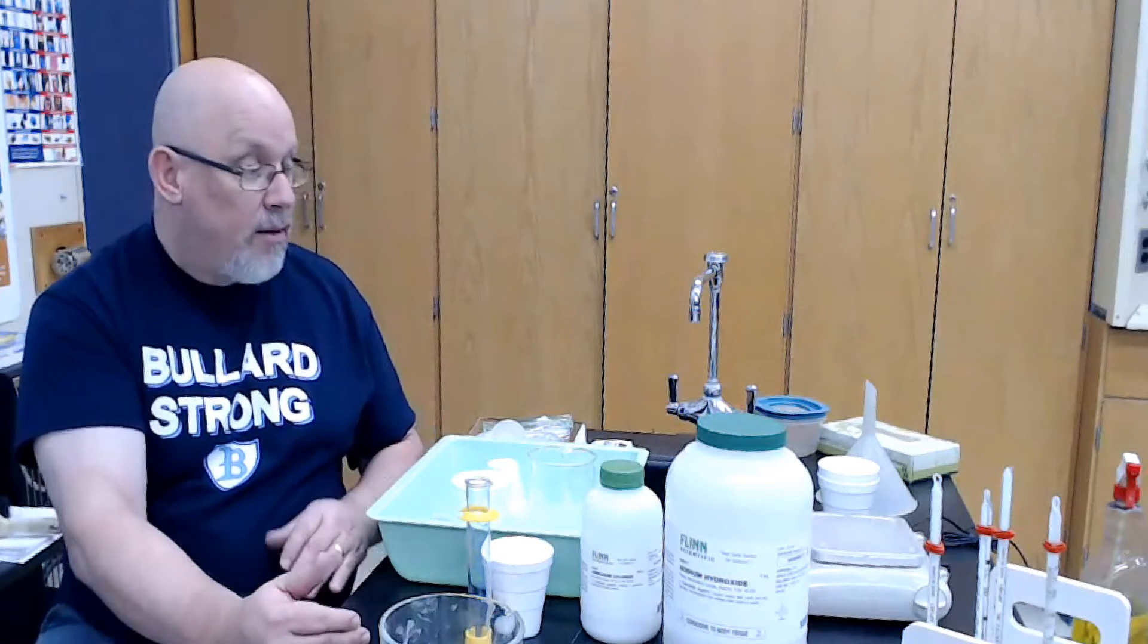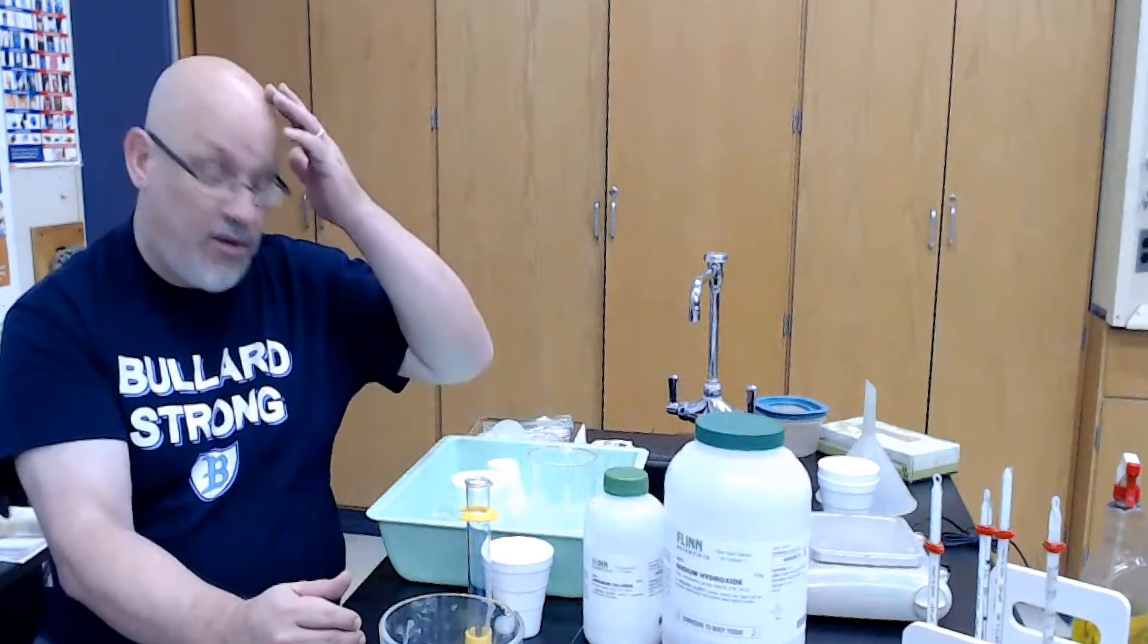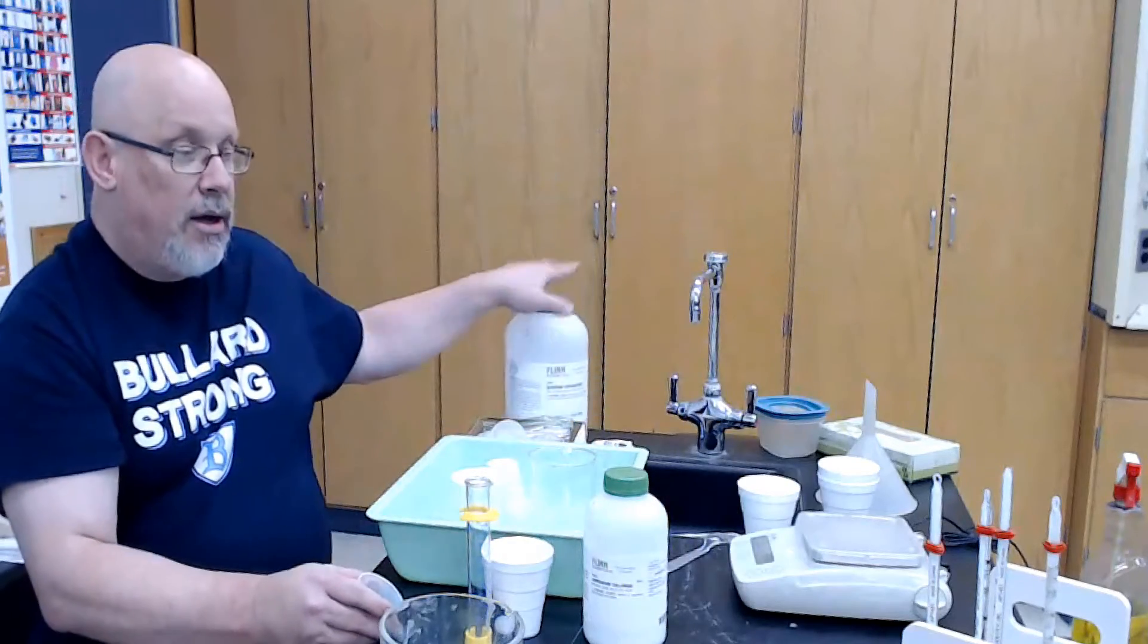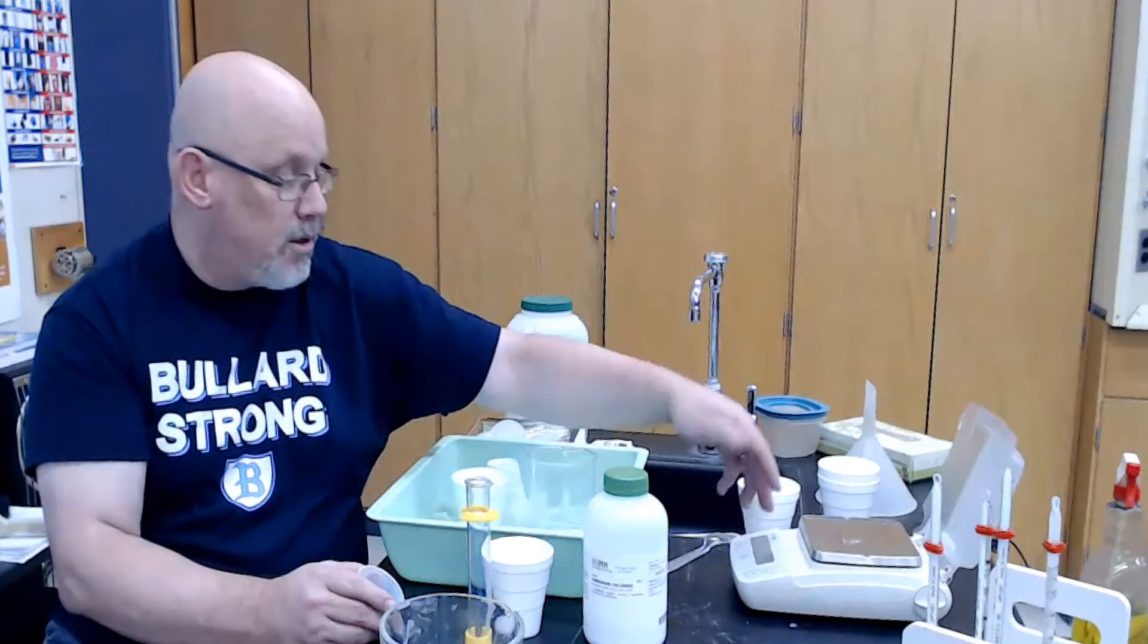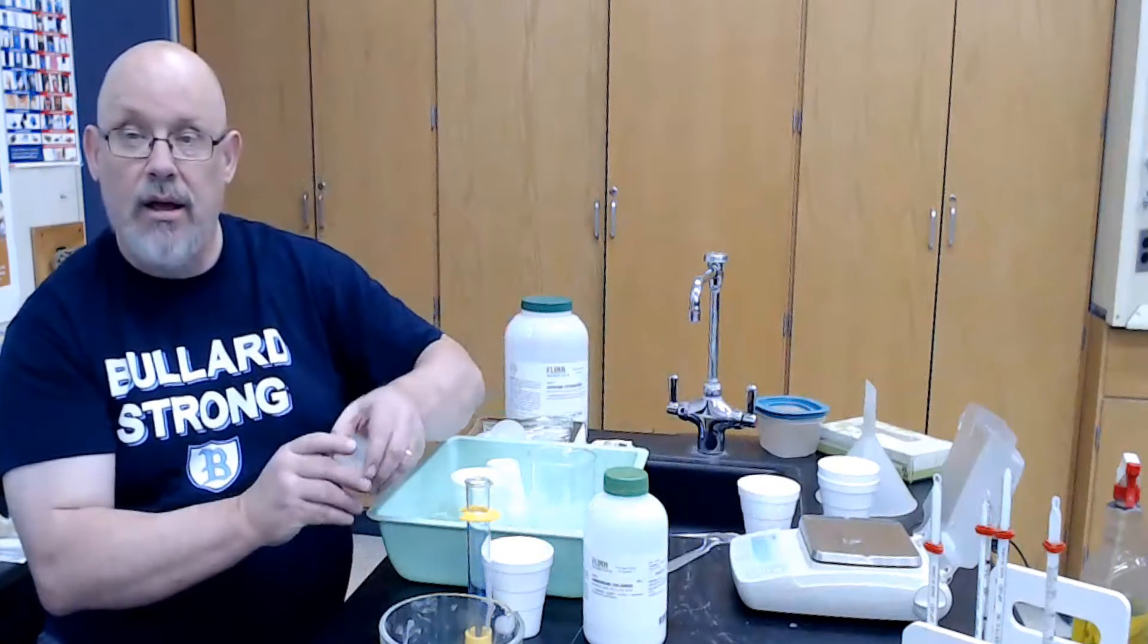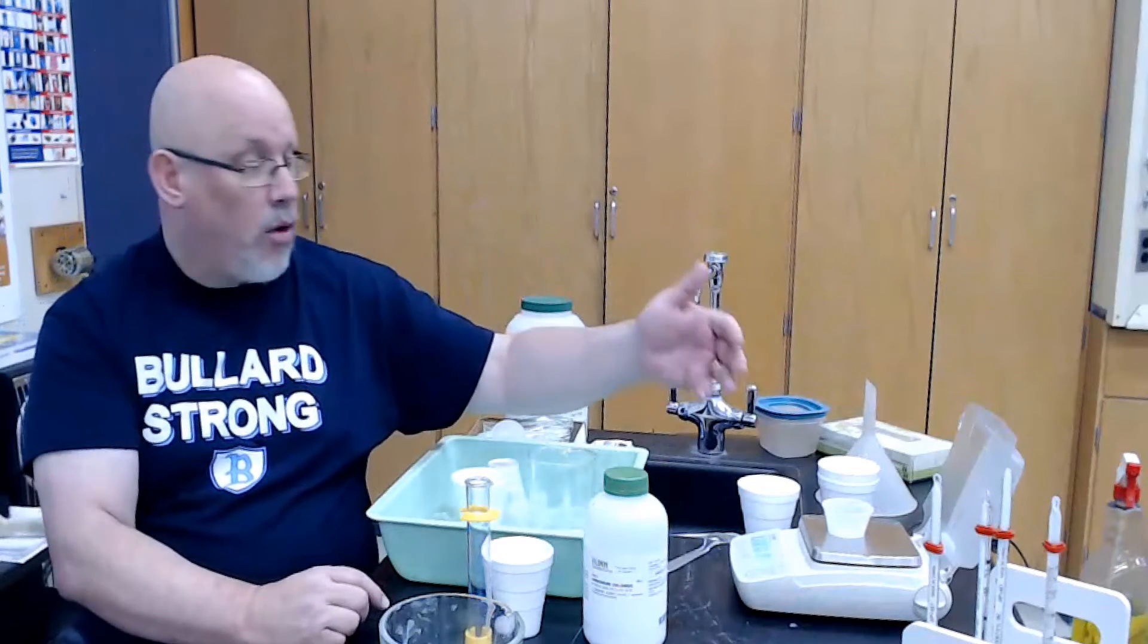Measure the volume of water, you automatically know the mass of water. Now, as far as the mass of the sodium hydroxide or the ammonium chloride, well, students will get those substances from me in little plastic cups. And it will be necessary for them to have determined the mass of their plastic cups beforehand by using the scales that are provided.